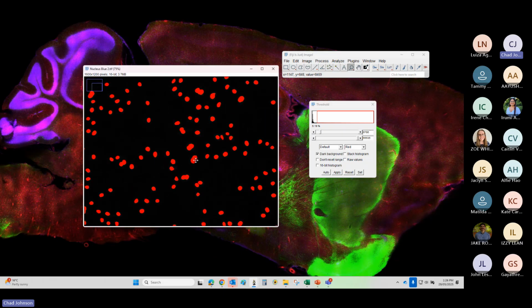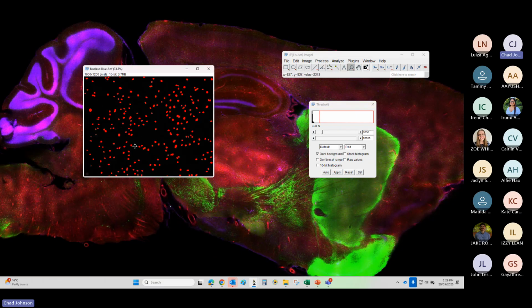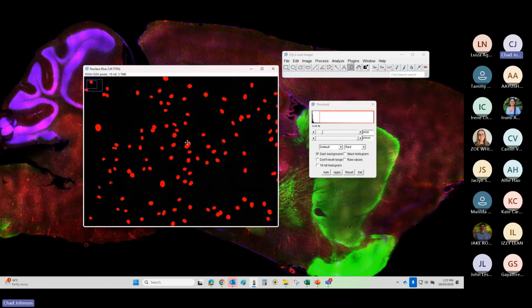It just helps a lot with separation of samples. So I'm going to make the threshold so that when 2 cells are very close together, like that, you still see that pinch point. That gives the software something to segment the cells with when we get to that point.